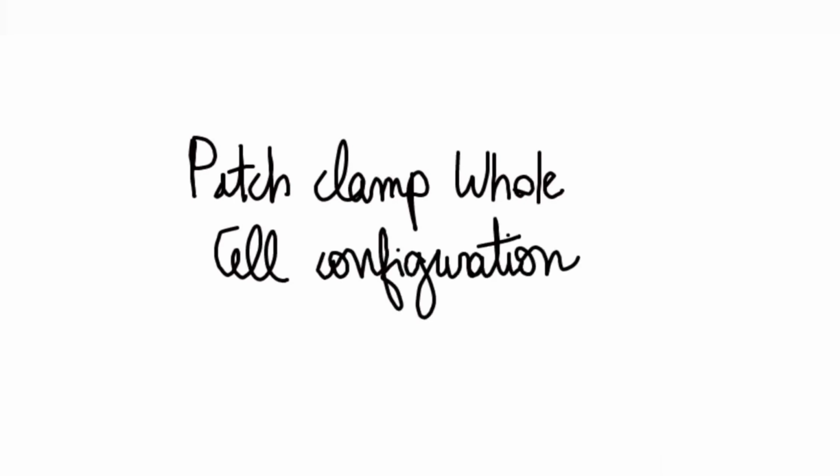Let's talk more specifically about the type of configuration. The technique of patch clamp whole cell configuration is more common for measurement of ion currents and the only one enabling measurement of action potential.